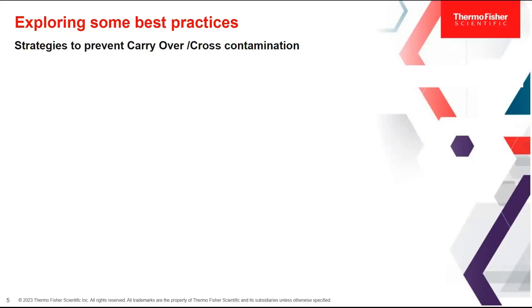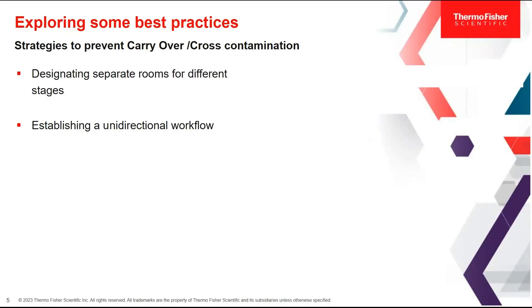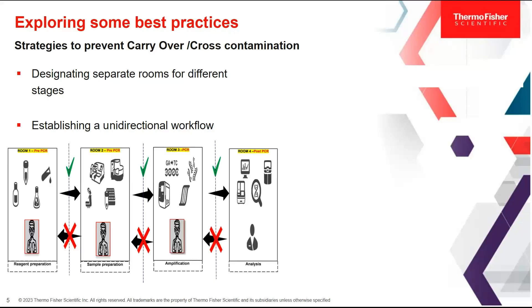Those were some of the more general lab strategies. Now let's move on to some specific strategies that are applicable for PCR workflows. Having a dedicated workspace and designated physically separate rooms or areas — such as pre-PCR and post-PCR — for the different stages of the workflow is essential. It is important to establish a unidirectional workflow to avoid backtracking and prevent accidental transfer of PCR products or contaminants between processed and unprocessed samples. As you can see in the diagram, I'm depicting the unidirectionality of any particular PCR workflow.